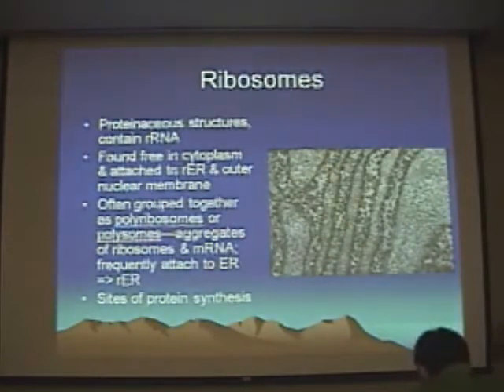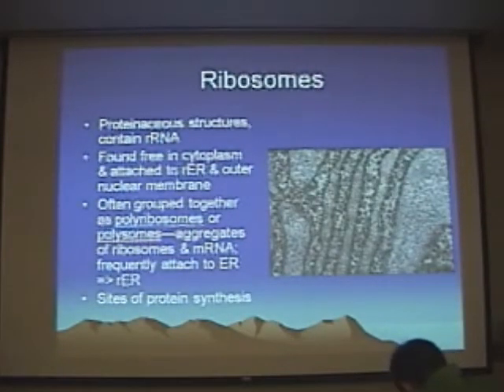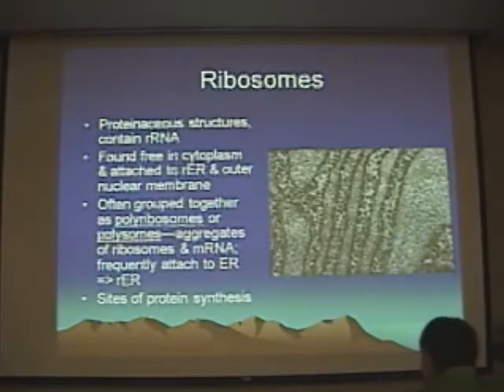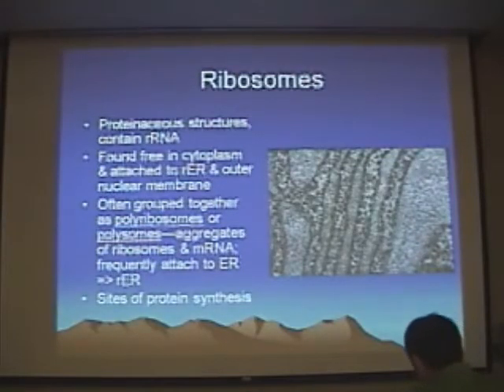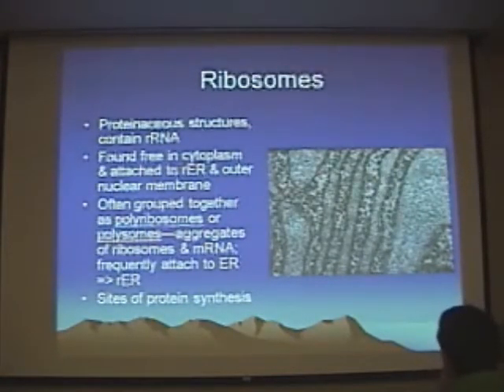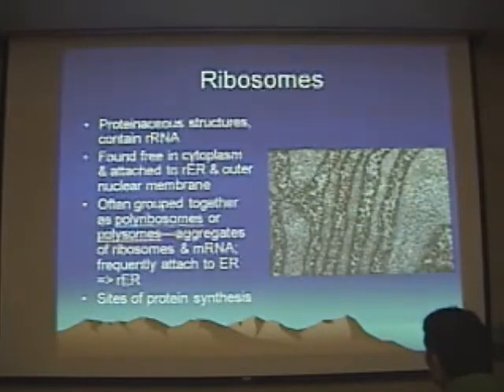The ribosomes tend to cluster along the endoplasmic reticulum. When they do that, that studding of the ER with ribosomes results in the formation of what's called RER — rough endoplasmic reticulum — because the ER now looks rough because it's got these big dark blobs on its length. You can see these dark spots on the electron micrograph, and they represent clumps of RNA.